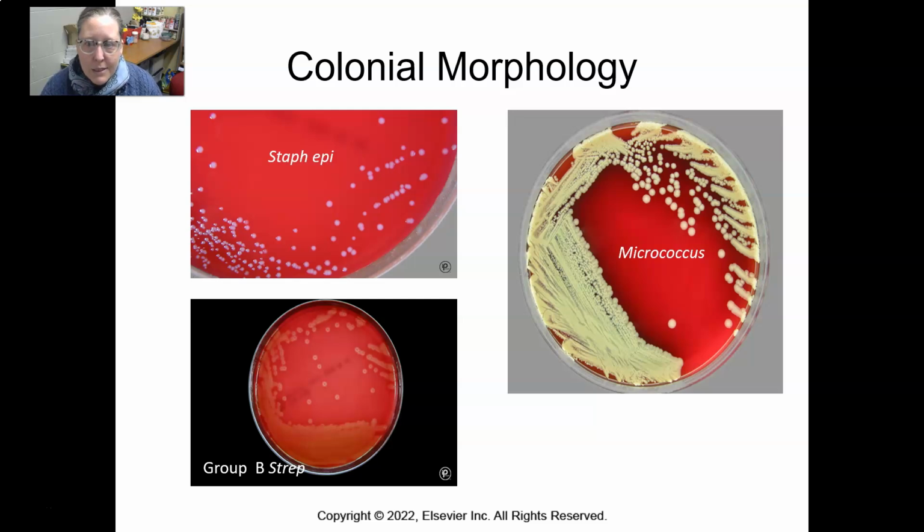Here are some examples of some small colonies that are very white-ish, almost kind of gray, but very nice, clear, crisp white. They're glistening, circular with entire margins. I would say they look slightly convex, but sometimes you have to angle the plate to be able to see that.